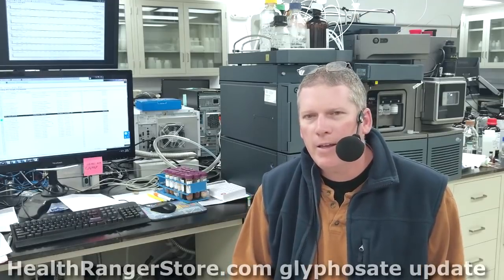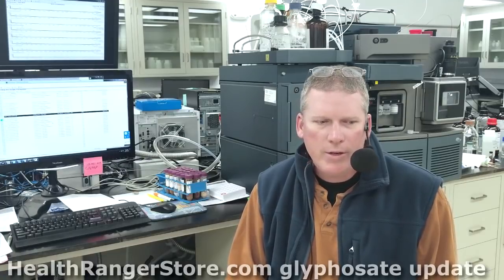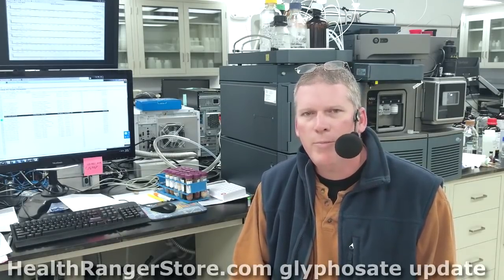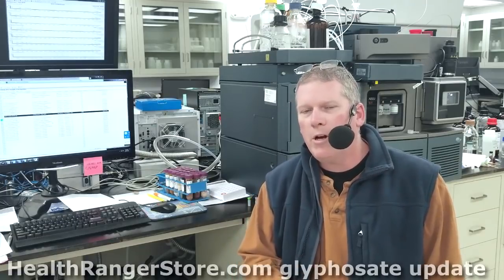You're not going to be able to do it in less than a year, probably, unless you're very, very experienced with HILIC, or reverse phase chromatography. It's a learning curve, even for PhDs. I've had PhDs in this lab that look at this and go, whoa, how'd you figure that out? Because that's really, really complex chromatography, complex with the metal ions. It's complex with fine-tuning the mass spec side of it, the detection, getting a quant curve that works, all that stuff. And I don't mean to geek out on you, but we've worked hard on this.